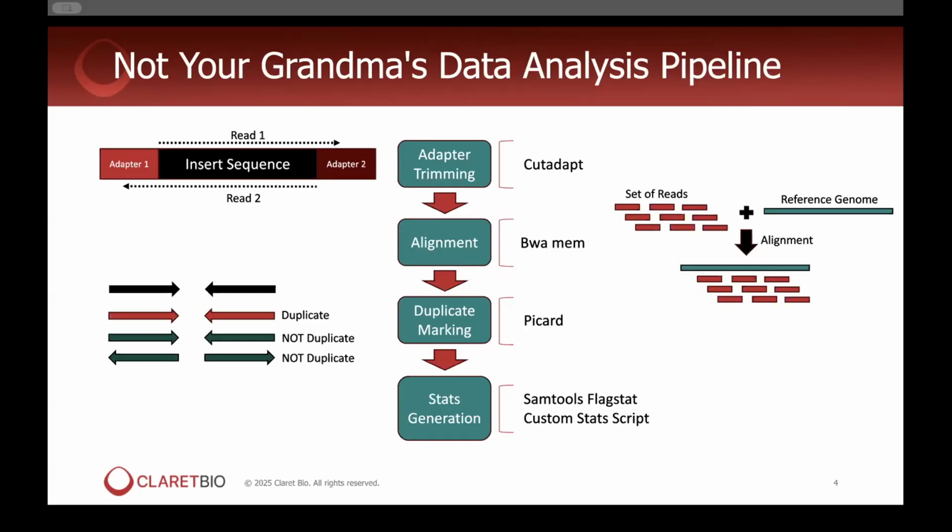And in this pipeline, we use cutadapt. There are many tools that are offered, but cutadapt is a great tool that runs very quickly and it works great with Illumina sequencing results and is a good tool that can hold on to the discarded reads and trims the adapters from the discarded reads and helps with dimer interpretation as well. And that's one of the reasons why we employ it in this pipeline.